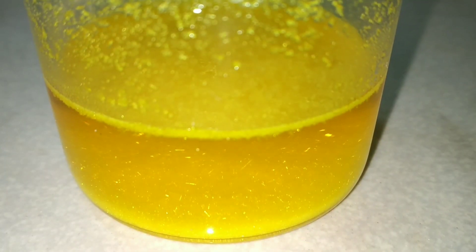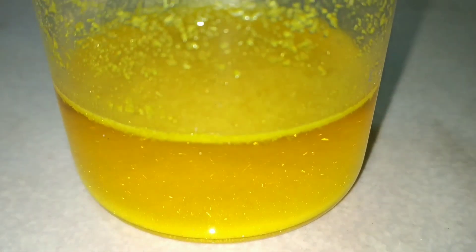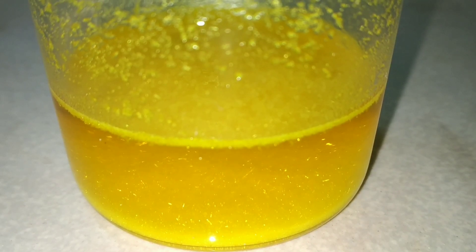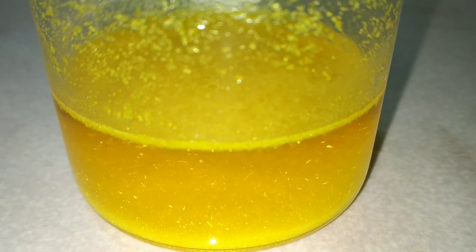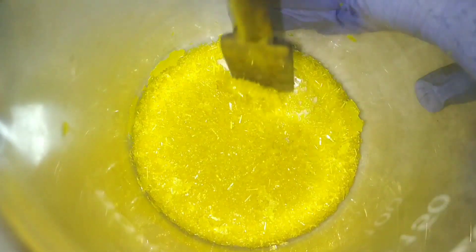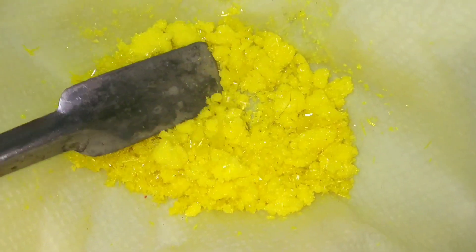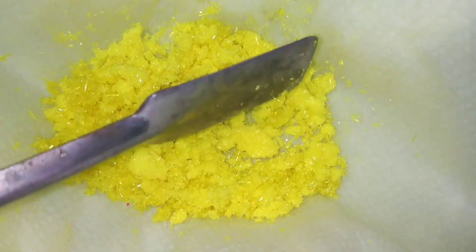Now I decant the mother liquor and here you have the crystals of potassium chromate. The crystals of potassium chromate have a needle-shaped structure. I did a second recrystallization from the mother liquor and these are the crystals formed. I then transferred these crystals onto a tissue paper to dry. Finally, these are the nice yellow colored crystals of potassium chromate from all that green fluffy chromic oxide.